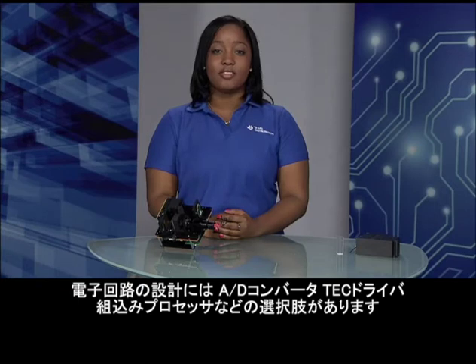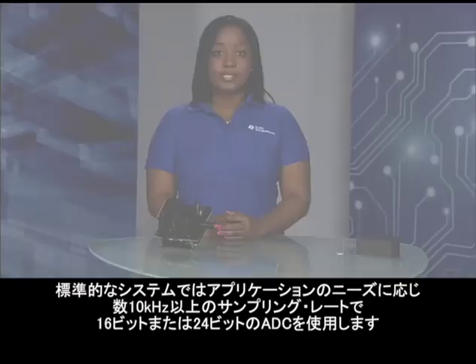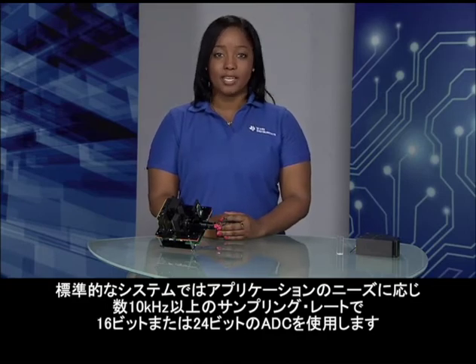Electronics design alternatives may be considered with the AD converter, the TEC driver, and the embedded processor. A system must have a low noise detector amplifier and an ADC to achieve high signal-to-noise ratio values. For a single pattern displayed on the DMD, multiple samples can be collected from the ADC in order to lower noise by averaging. A typical system will use a 16 or 24-bit ADC at sampling rates in the tens of kilohertz or higher, depending on the application needs.